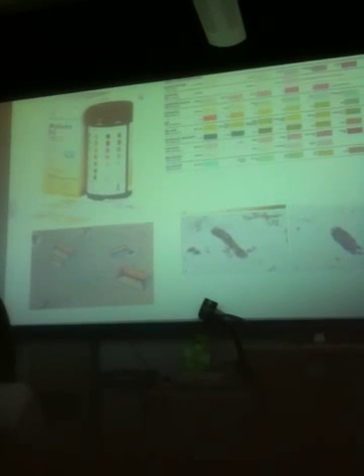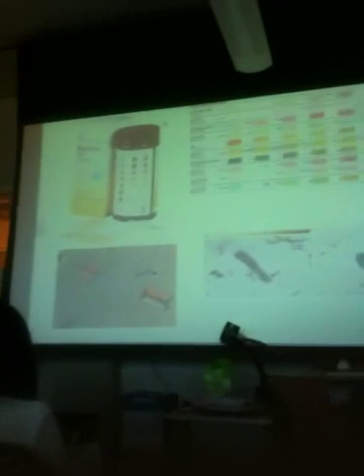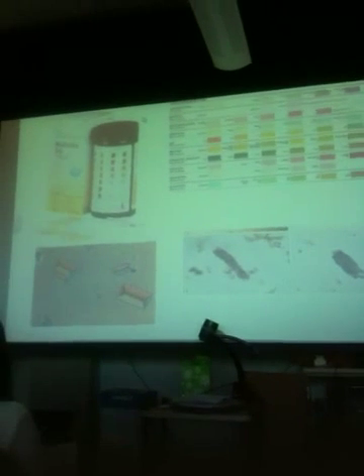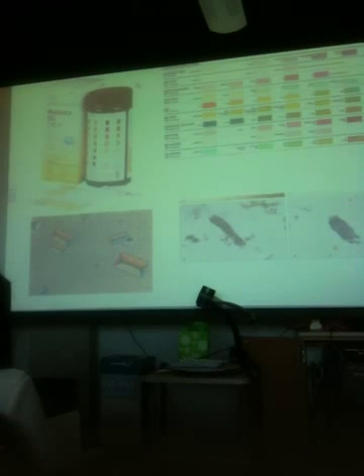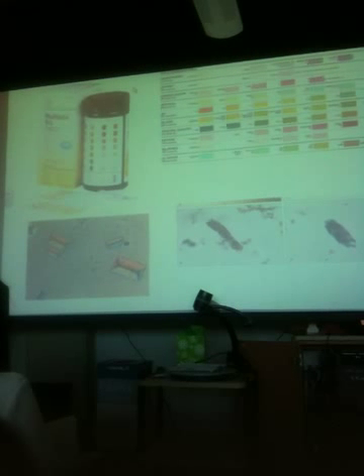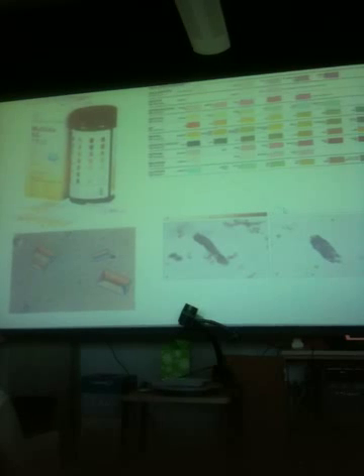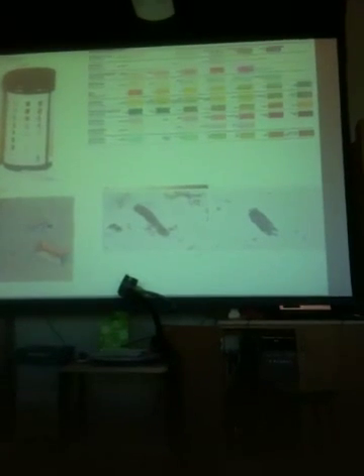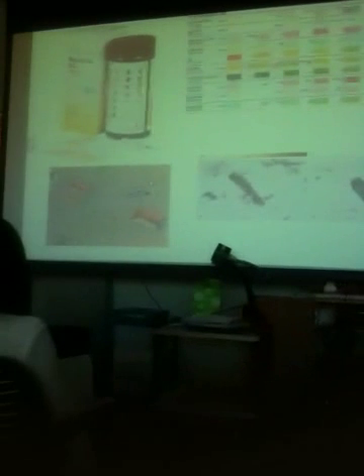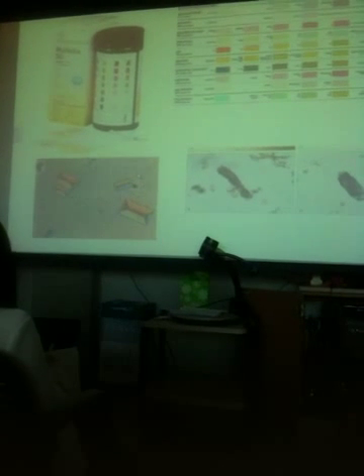So the other things we looked at in urine were sediments. We looked at cells, casts, and crystals. You don't need to be able to differentiate this kind of cast from that kind of cast, a red blood cell cast from a white cell cast versus a fat cast. But you should know at least what these are. Are these casts or crystals? These are casts. What are these? Crystals. Crystals are easy to delineate because they look like crystals.